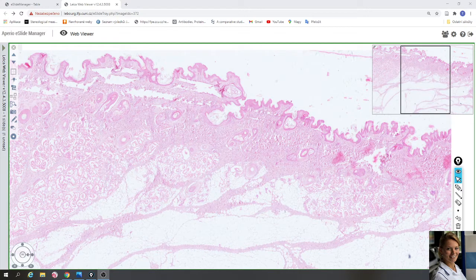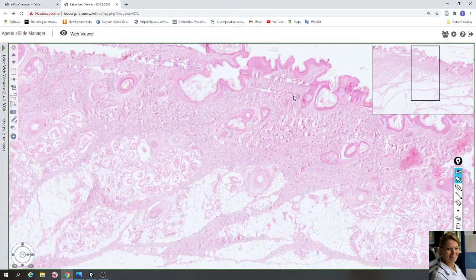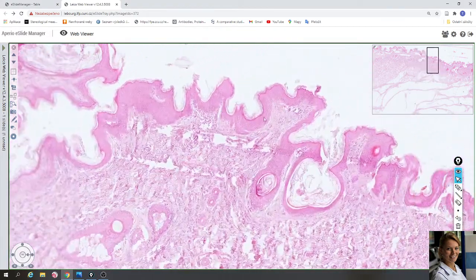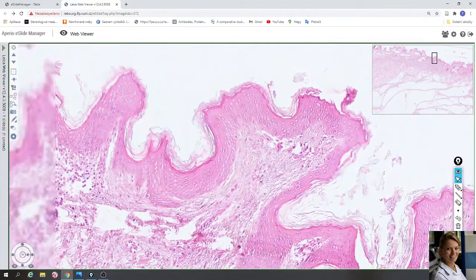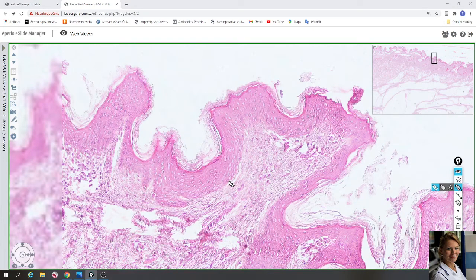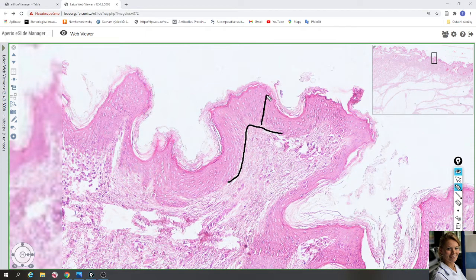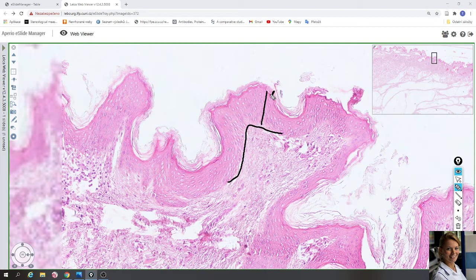The surface of axilla is covered by epidermis — stratified squamous keratinized epithelium. Here you can see the basal membrane and many layers of stratified squamous cells, because the last visible nuclei are squamous and keratinized. Here is the stratum corneum, which consists of dead cells. So this is the epidermis.